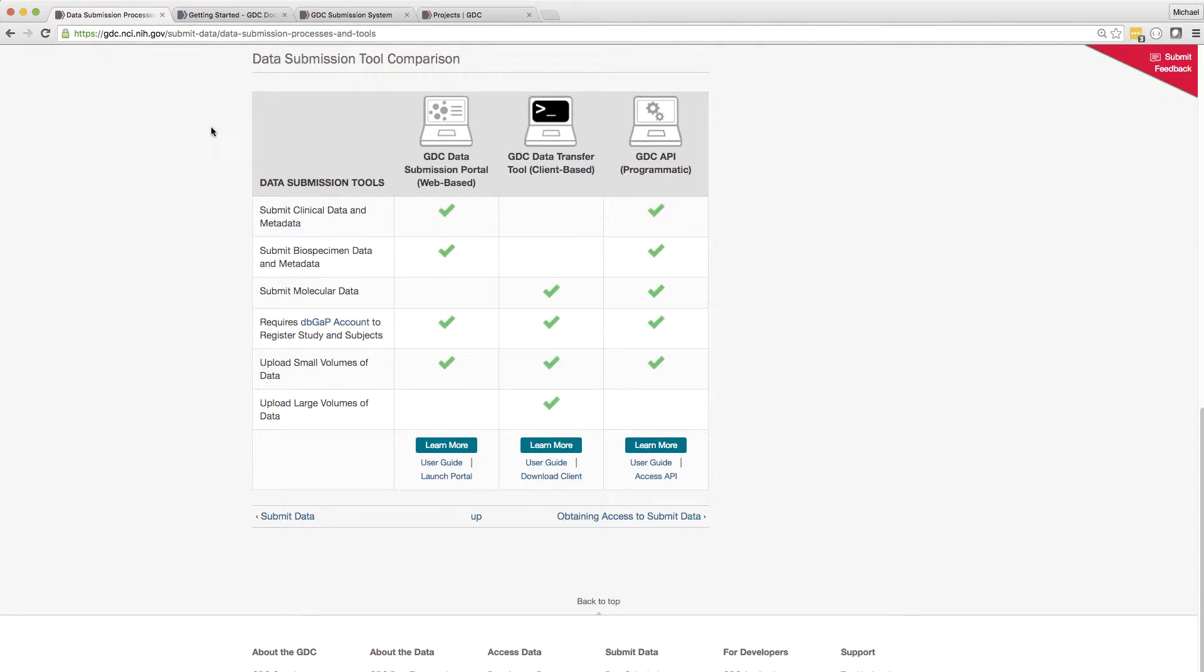Let's take a look at how to use the DTT for data submission. Later I will demonstrate its use for downloading.